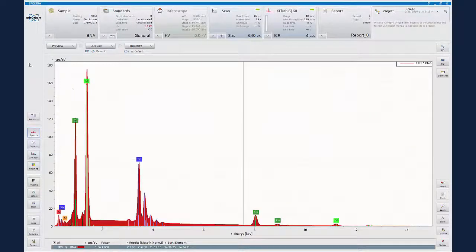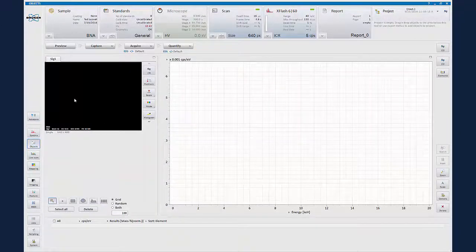Upon starting the software, you have the workspace list here, which are your various operations and controls. And on top, you have your configuration bar, which allows you to set defaults for both the software and the hardware for the analyst. Our most basic controls are spectral collection, object mode, which allows us to collect images and spectrum, annotate the image so that we can collect spectrum at various locations about it. Very nice tool to check for homogeneity, document differences within the sample, or just general quantitative analysis.